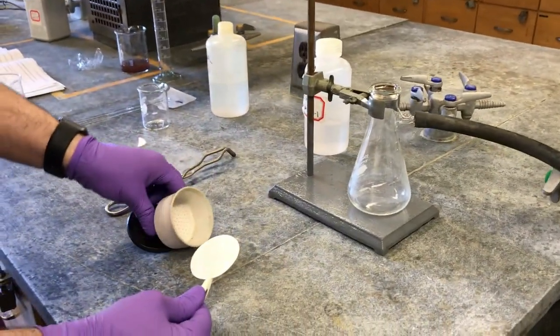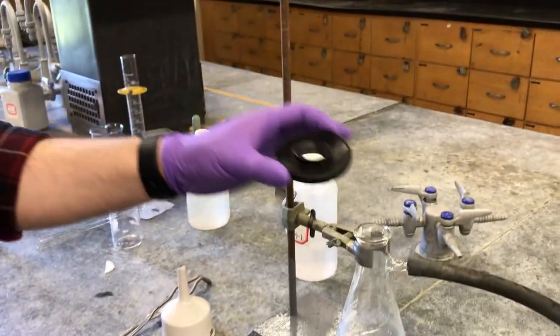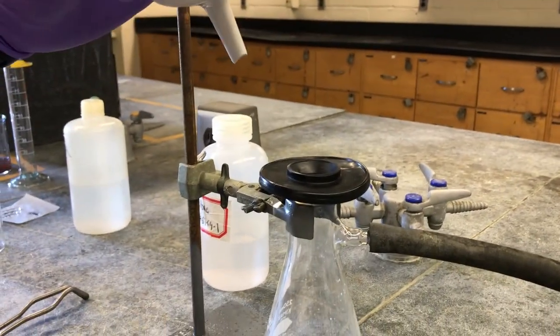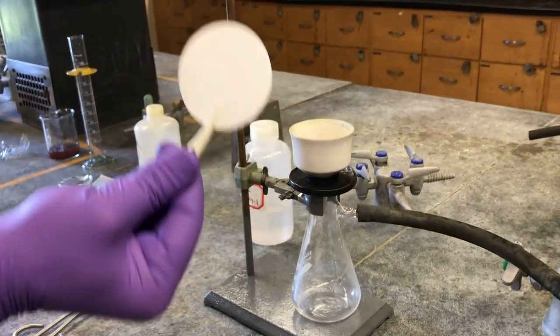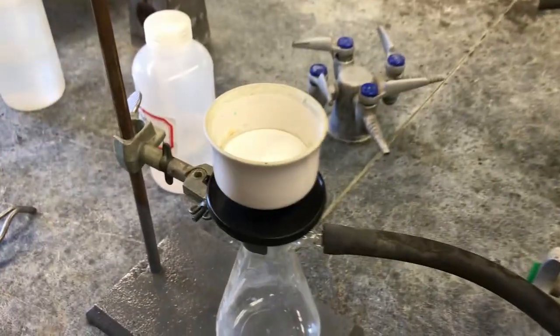So right now what we'll need is first this rubber ring, and you want this edge up. When you add the ceramic funnel, it'll sit nicely on this rubber ring. And finally, we want our filter paper. We're just going to place that right here.